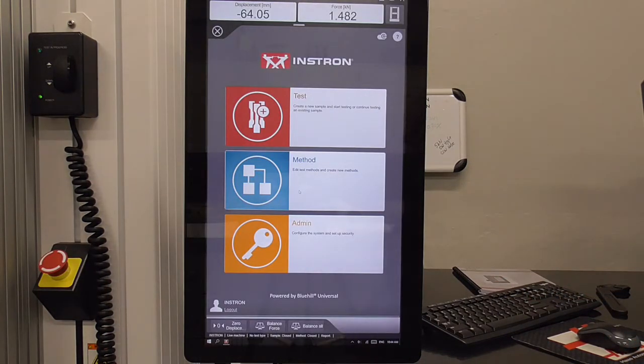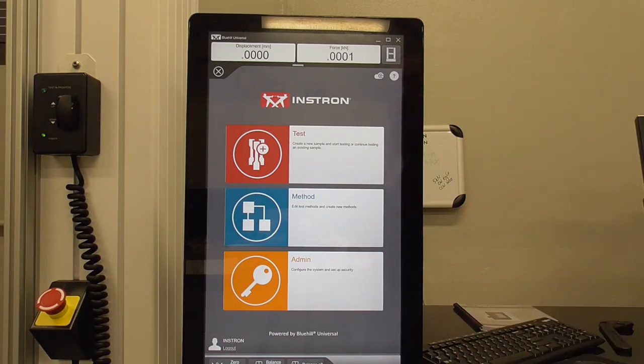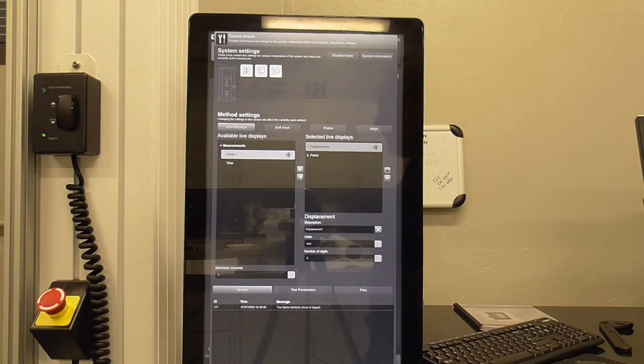This is our home screen. When you first begin operating the Instron, you have to calibrate the load cell. You can access the calibration software with this icon here in the upper right — you can see this is a touch screen.